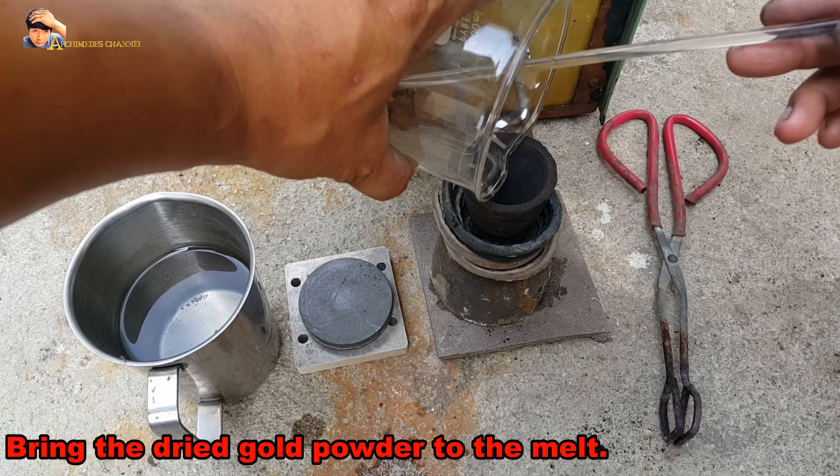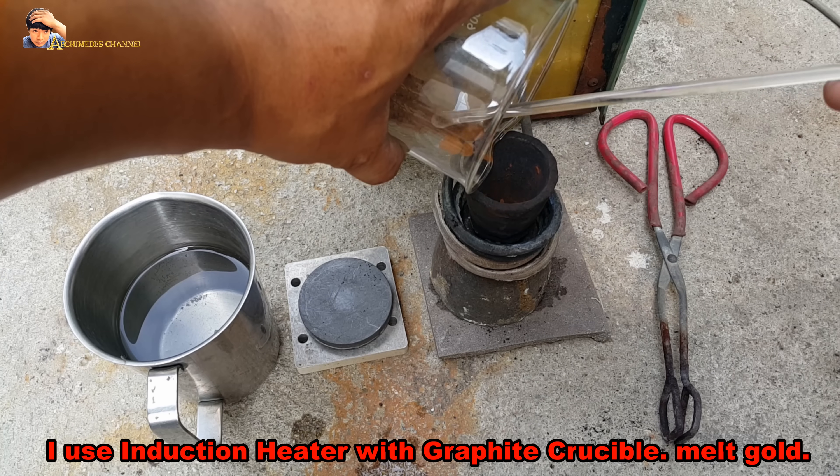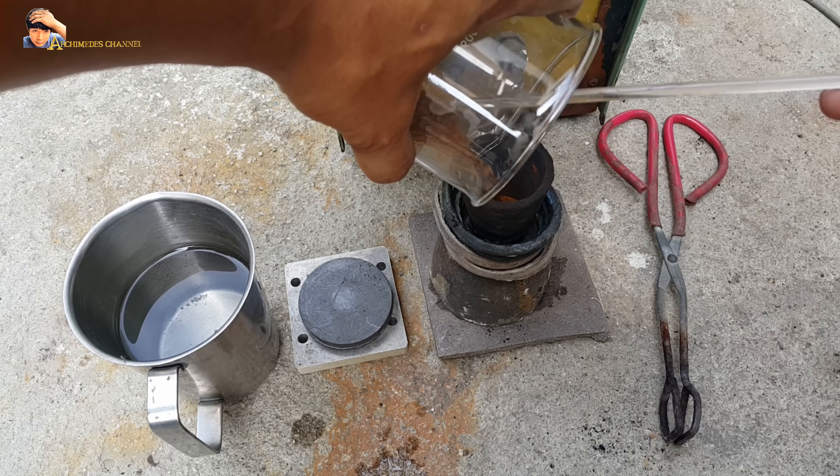Bring the dried gold powder to the melt. I use an induction heater with a graphite crucible to melt the gold.